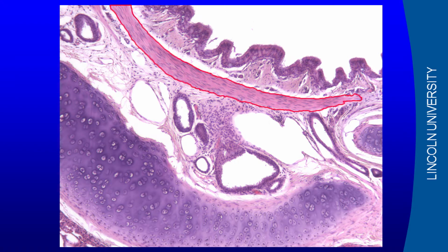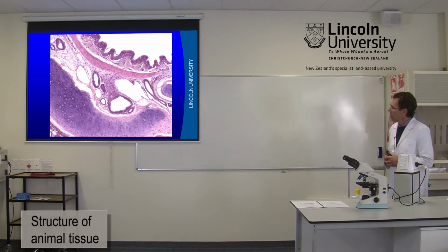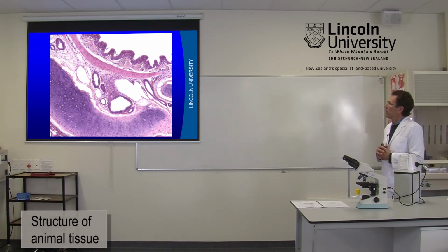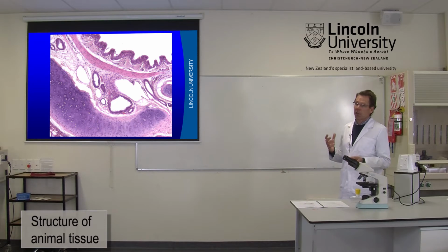Inside here is that muscle there. This is smooth muscle. The difference between smooth muscle and striated muscle, apart from the appearance, this will not have those lines across the fibers. So striated muscle has that name because of those stripes, but functionally they're different too.